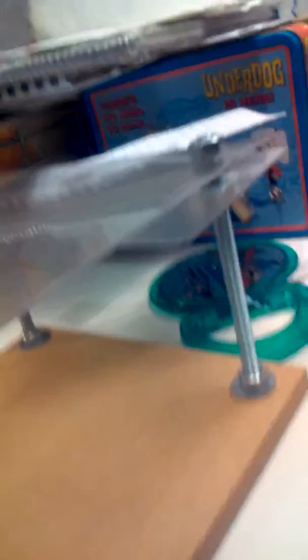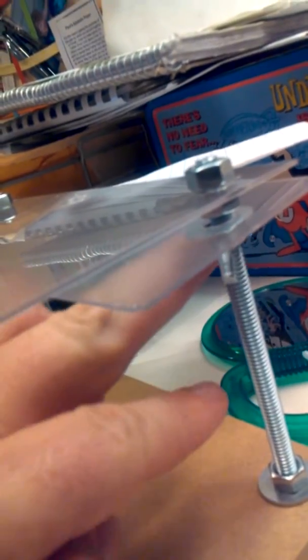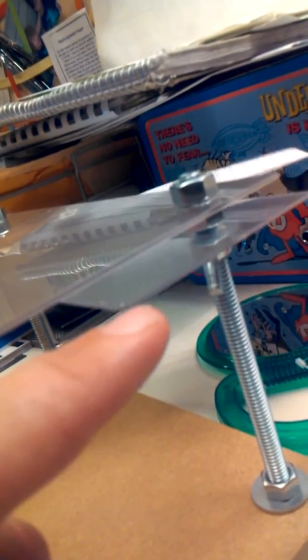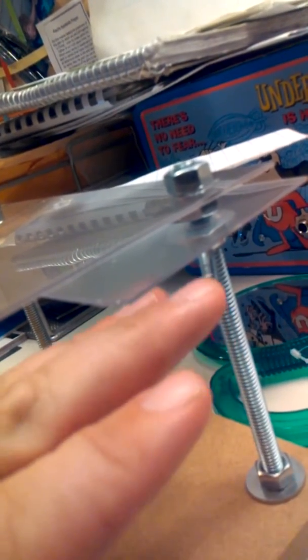And these little wing nuts right here raise and lower this specimen tray. That's where you put your specimen that you want to look at. It raises and lowers it, and try not to make you sick here.